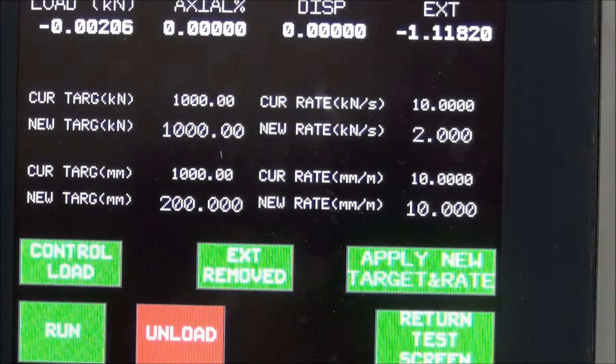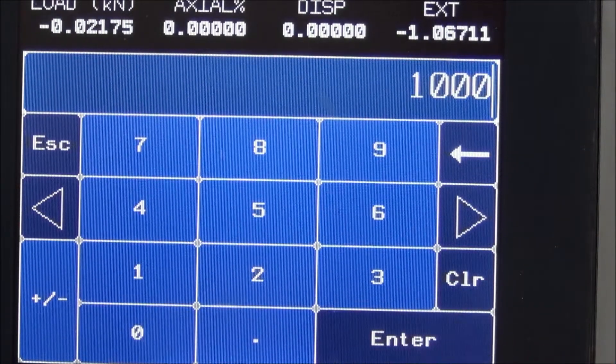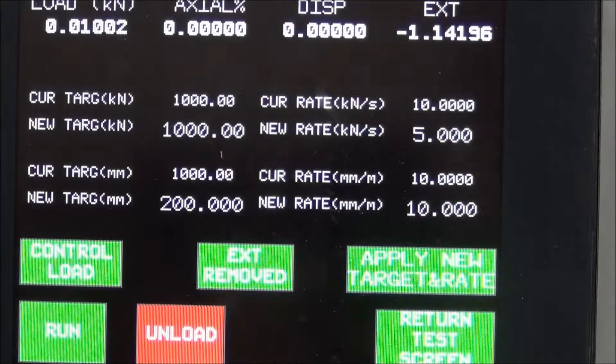The first values shown are the current load and pace rate values. Touch the new target or new speed to change the load and the pace rate. After you change the values, touch the apply target box. The new values will be displayed in the current values fields.